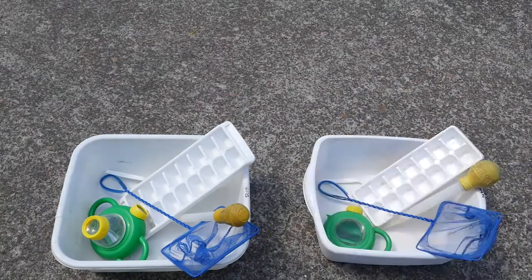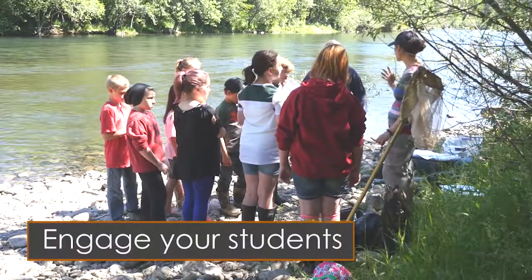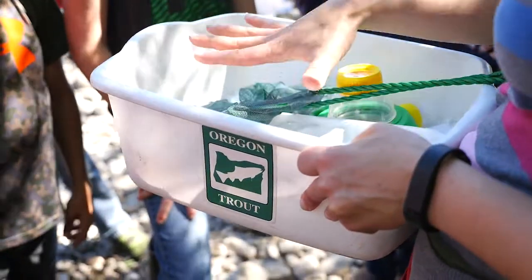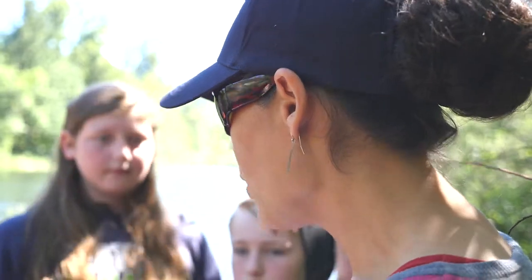Divide the equipment up before the students arrive so they can do their sampling in smaller groups. Once you arrive at your location, make sure your students understand how macroinvertebrates can help us learn about the health of a stream. You can use the lesson plan in the kit to engage the students by asking simple questions about water quality, stream health, and macroinvertebrates.